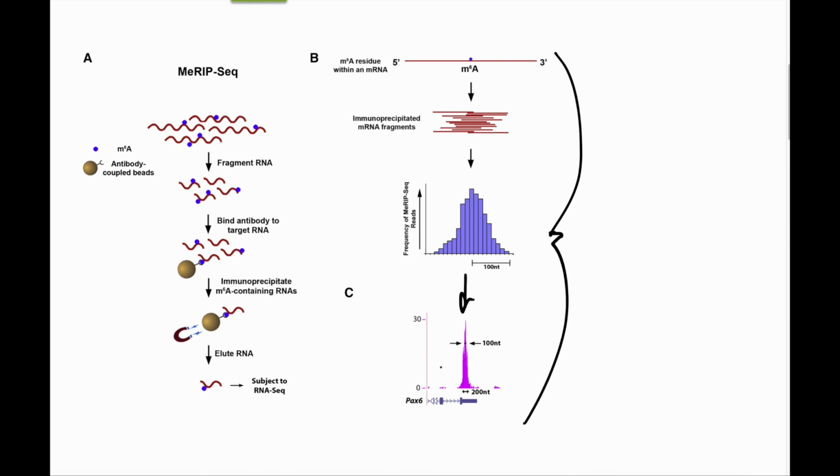m6A modified. These strategies rely on high coverage in a particular region, and therefore it takes a large amount of sequencing data in order to accurately identify a given site. Nevertheless, for the purpose of this systematic comparison between tools, these kinds of strategies, including ME-RIP-seq as shown here, but also m6A-REF-seq, miCLIP, and miCLIP2 were utilized in order to generate ground truth data sets for comparison and further analysis.